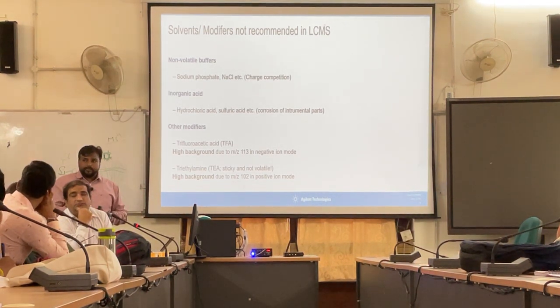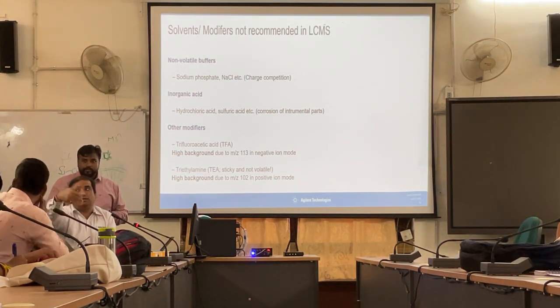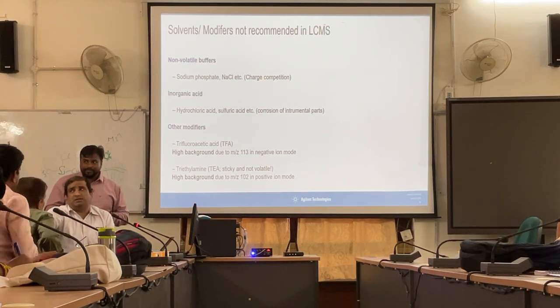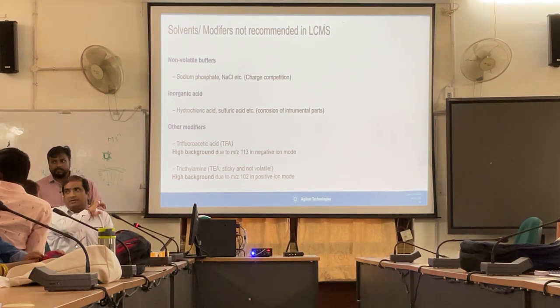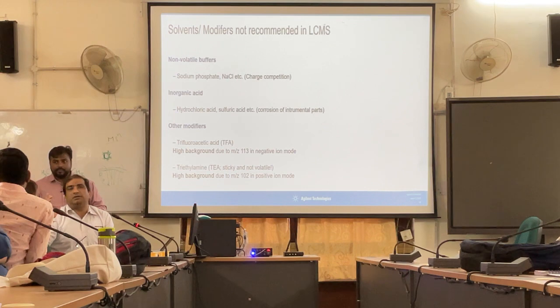So in this configuration, HPLC coupled with mass spec, you have to consider the mass spec also. You cannot just say I want to do everything with HPLC and then couple the mass spec. So these are the considerations for mass spec. And fronting and tailing, what will you achieve by removing fronting and tailing?